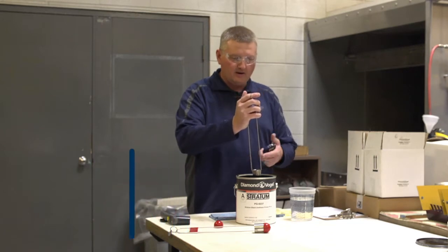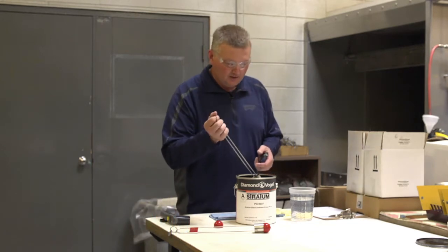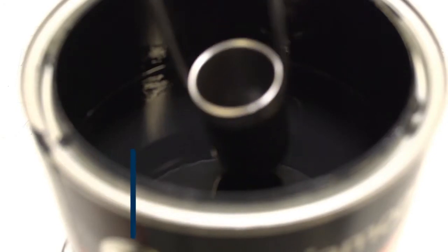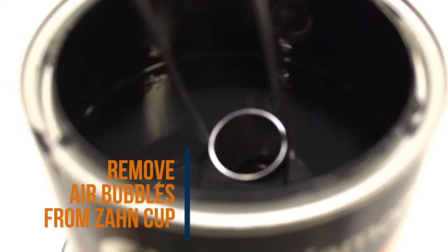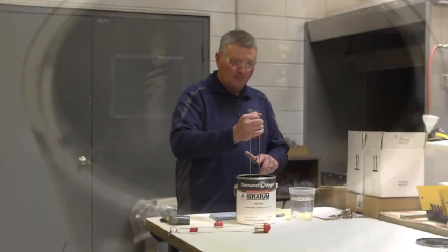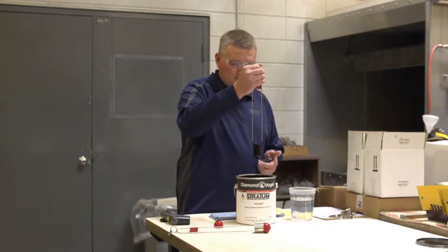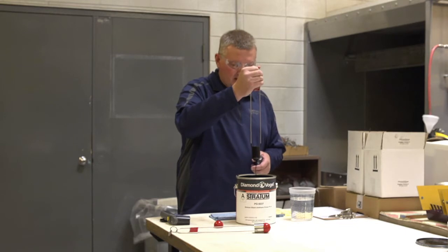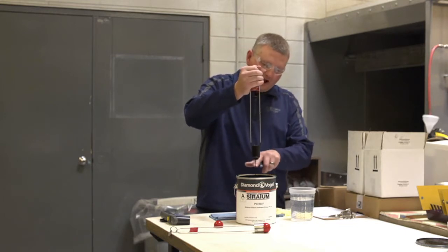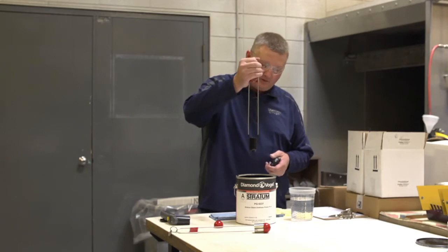If you go straight down, the air in the cup is going to create a splash and it's going to get all over your hand. So move the cup around, get rid of any air bubbles, fill your cup, and once your cup crowns out of your material, that's when you want to hit start. When you stop it is when the stream will stop one inch below the cup.